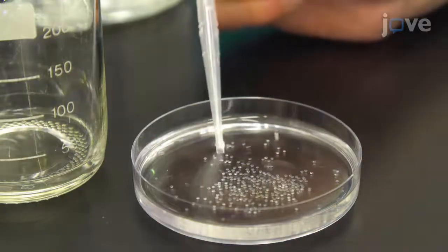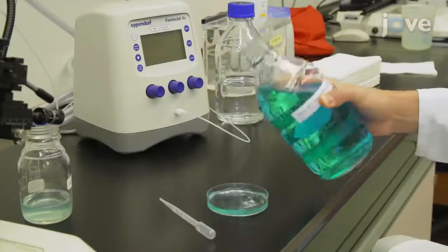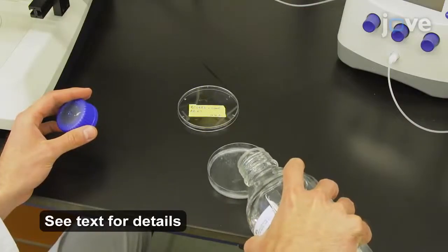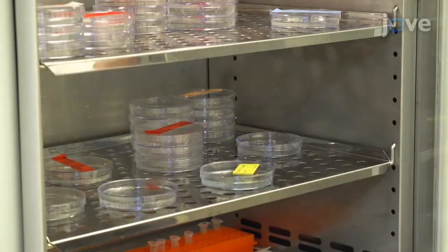Remove the dead and contaminated eggs with a plastic pasture pipette. Wash the eggs once with Danio 30% with 0.0001% weight per volume methylene blue. Then replace the medium with fresh Danio 30% without methylene blue, and incubate the eggs overnight at 28 degrees Celsius.